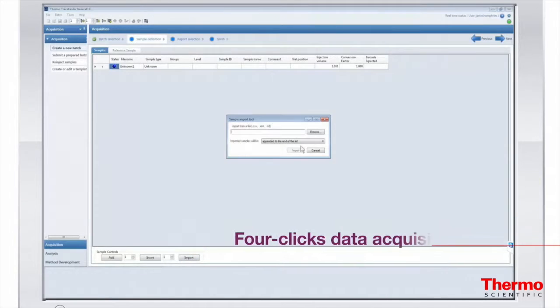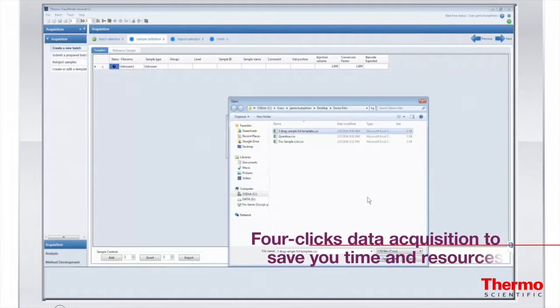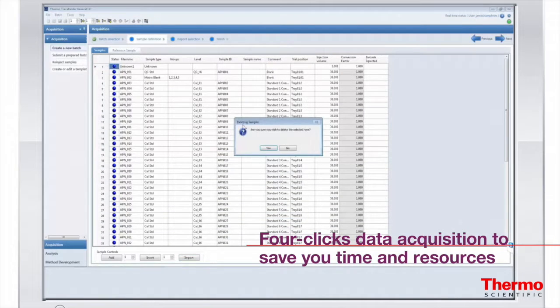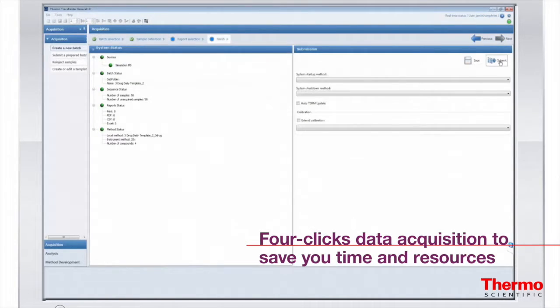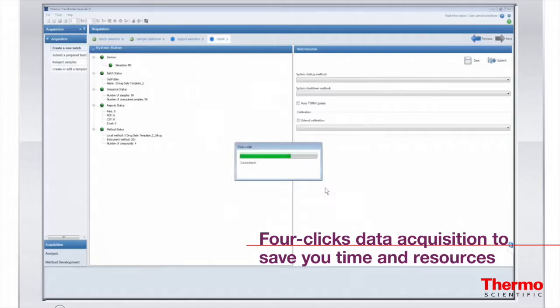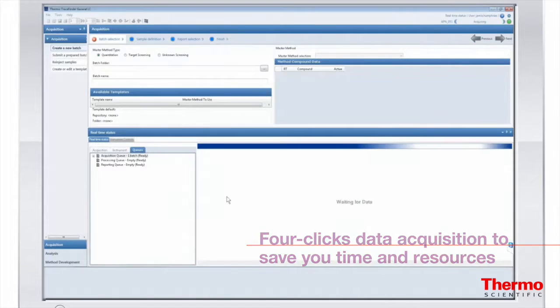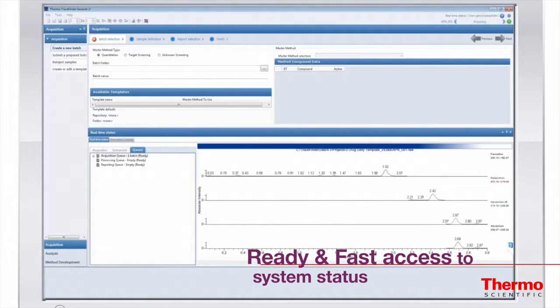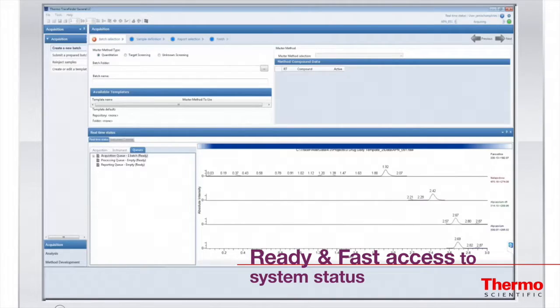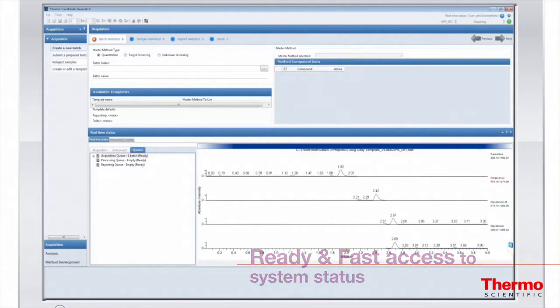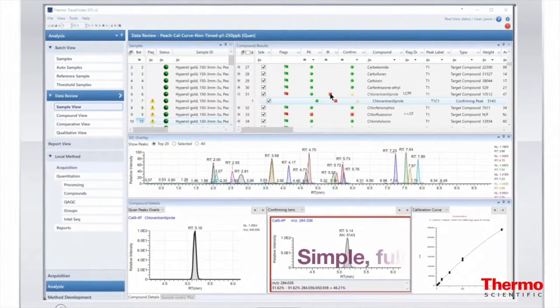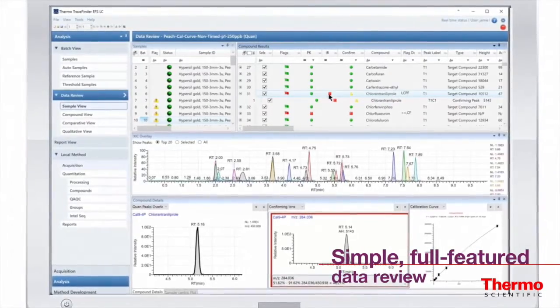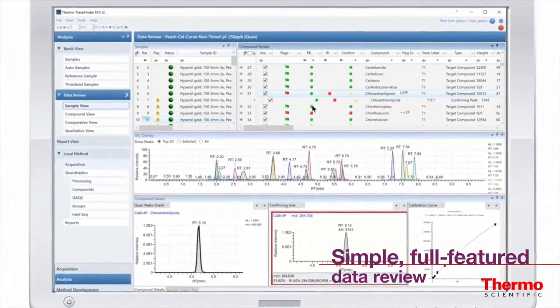TraceFinder requires just four simple steps to take you from the selection of your batch template to submission of your sample batches and initiating analyses. Readily monitor the progress of your batch with the real-time viewer, and quickly and easily observe your data processing status and take appropriate corrective steps if needed.